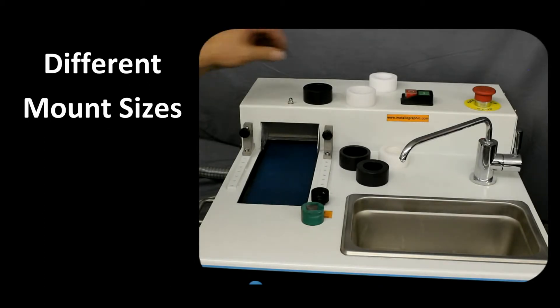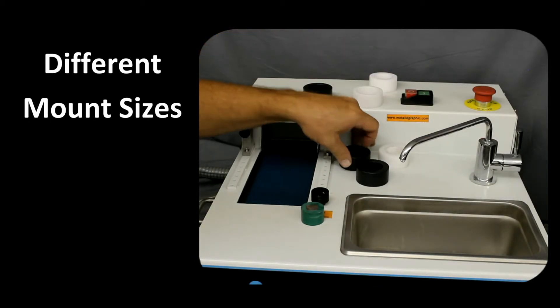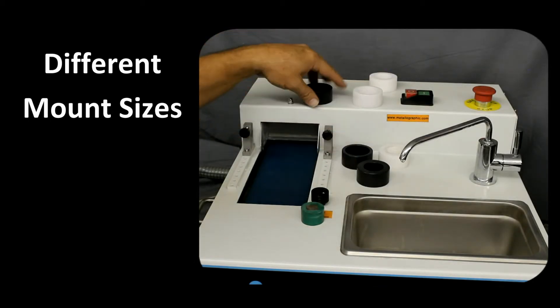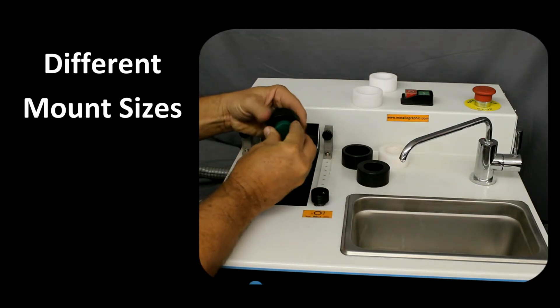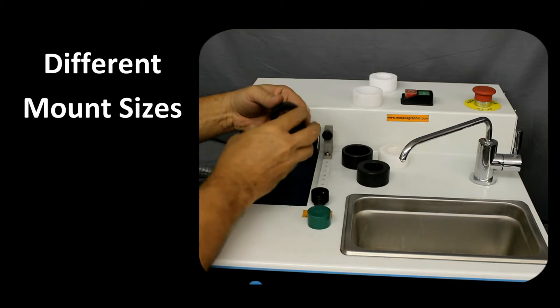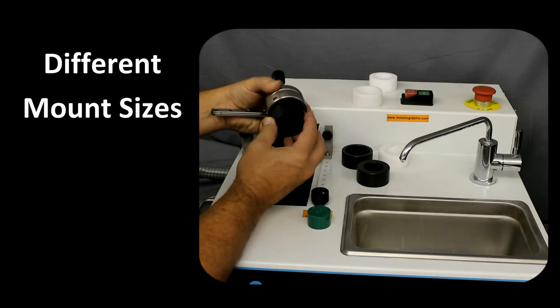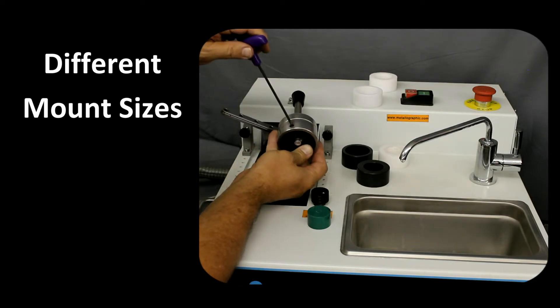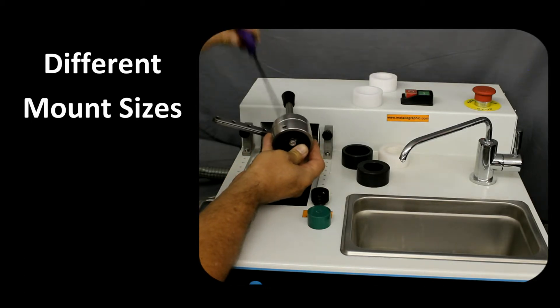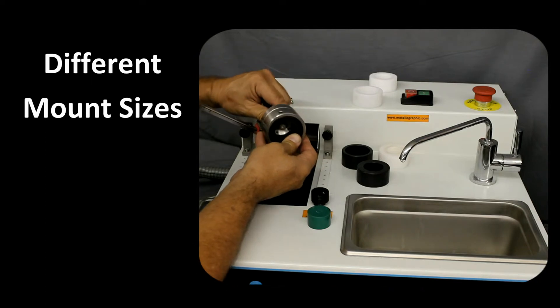The holder can be easily adapted for different mount sizes by replacing the ring on the holder with the correct size ring. Simply loosen the set screws to remove the existing ring, insert the alternative ring, and tighten the set screws.